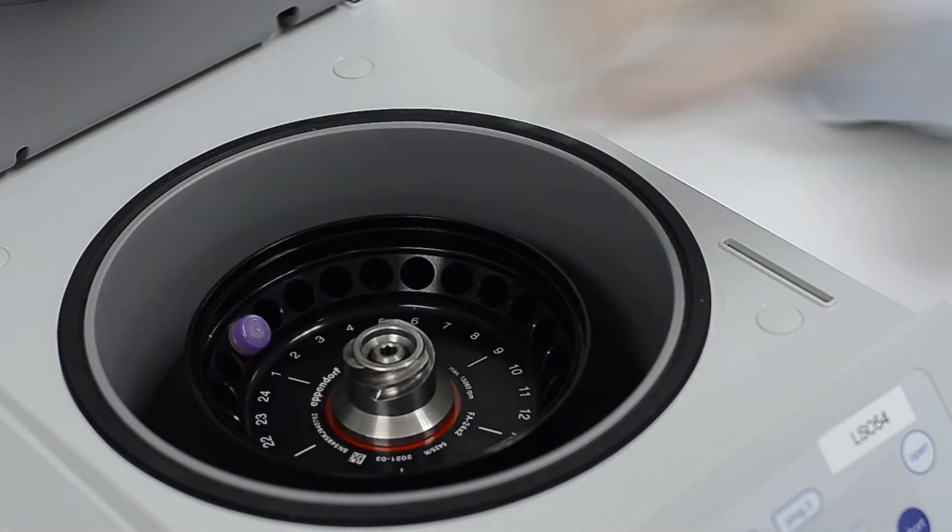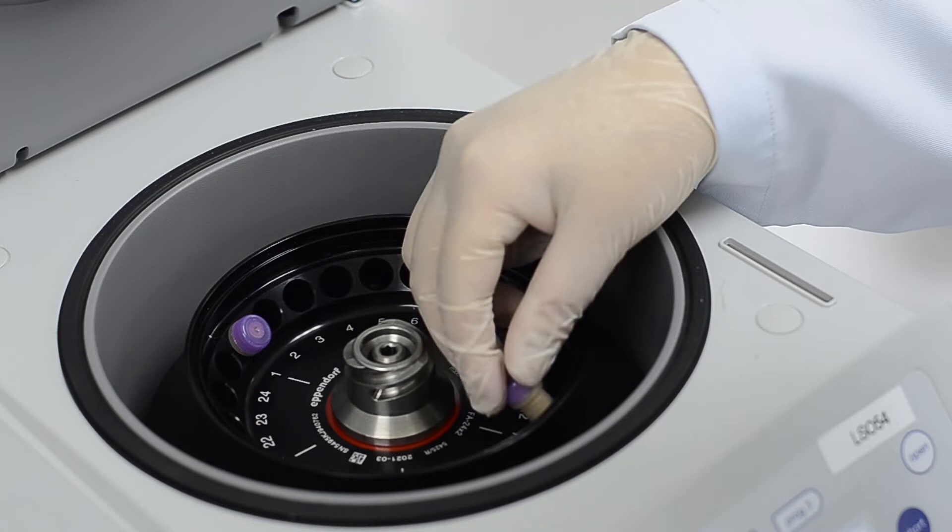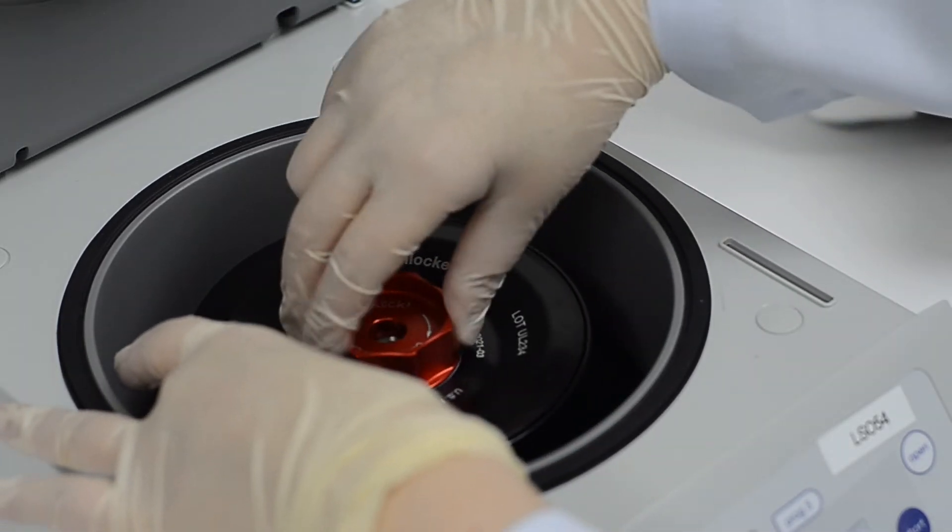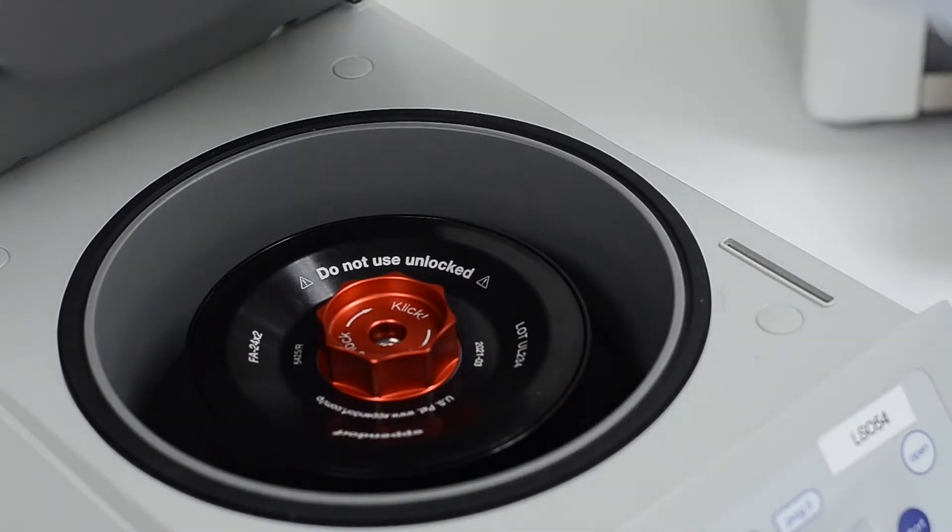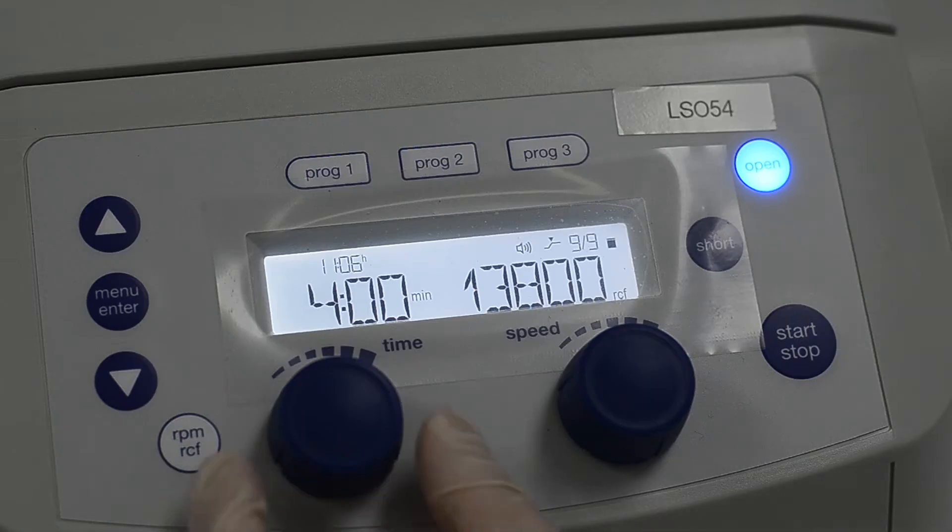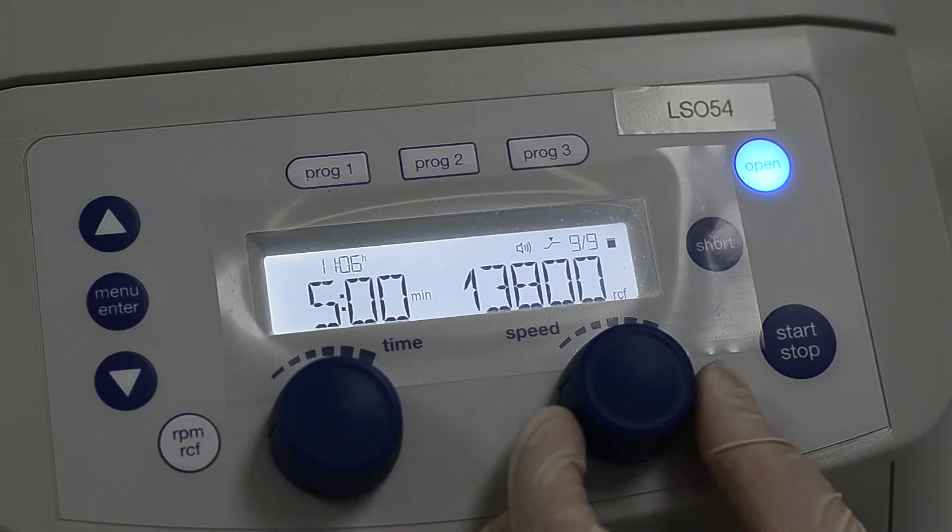Transfer the tube to a centrifuge machine. Centrifuge the mixture at 14,000 G for 5 minutes to spin down the debris.